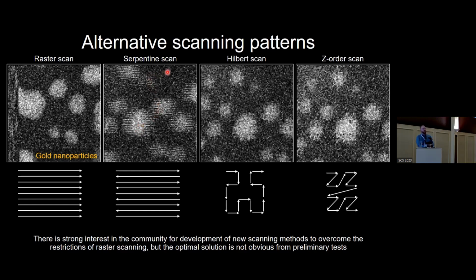There are ways that you can fix this because it's relatively simple. The problem is that this distortion is nonlinear across the image. So on the left-hand edge versus in the middle, you're going to get different amounts of distortion. We don't show it here. So that's something you need to take into consideration, and people do that. That's a fine way of avoiding the flyback.